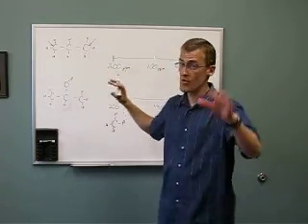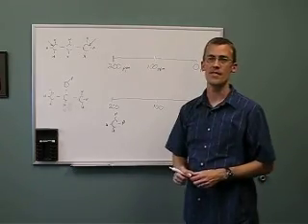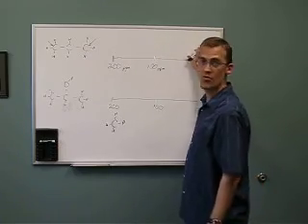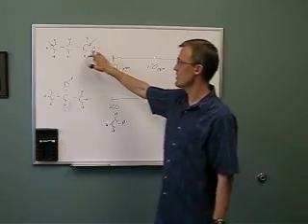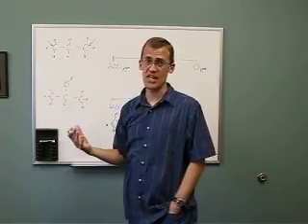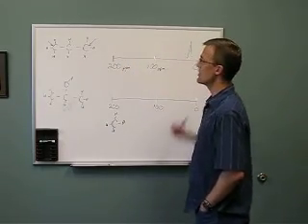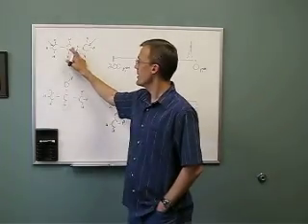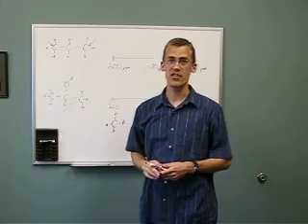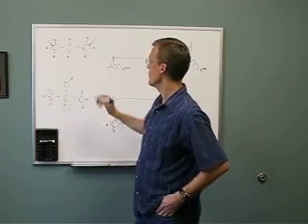Terminal carbons, for the most part, are going to be the most upfield shifted of any of the carbon atoms we see. So if you have 4 or 5 peaks here, assume the first one, farthest right, is going to be a terminal or an end carbon. So at this point we'd say these two are pretty much the same, and they're on the end, so they're going to show up in this direction. And carbons that have more carbons attached to them, the more substituted or more branched they are, or if they have electronegative groups, that's going to cause them to be downfield shifted a little bit.